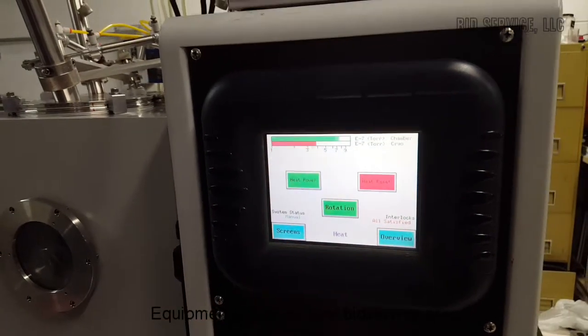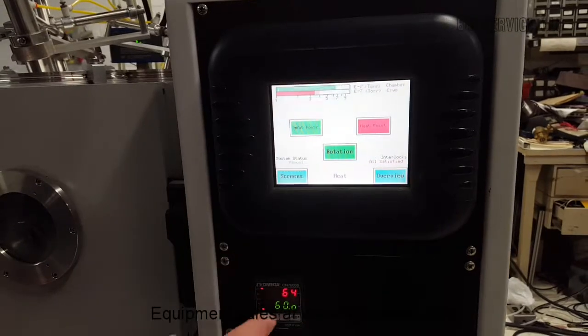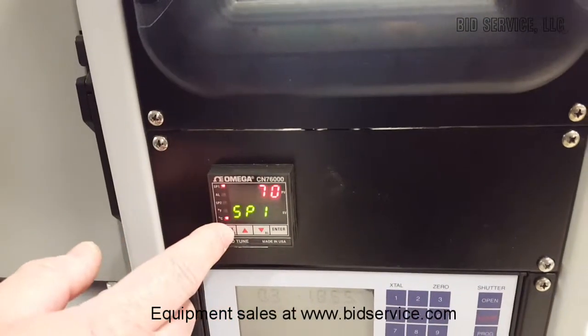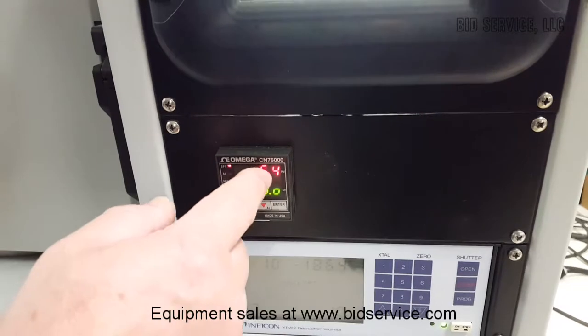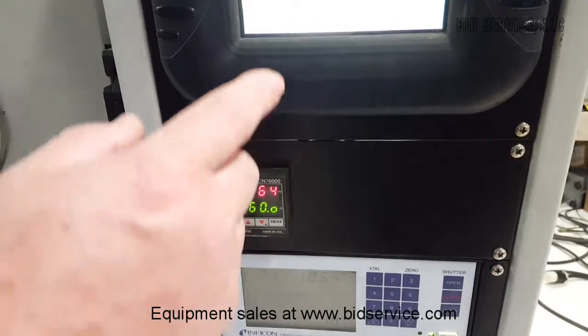For heat, you have a heat controller down here. All you do is turn it on up here to make it activate. Right now I have it set at seventy degrees. When you go back to the screen, it's showing that it's putting out sixty percent output right now, and you'll see this come up slowly depending on what your PID parameters are.